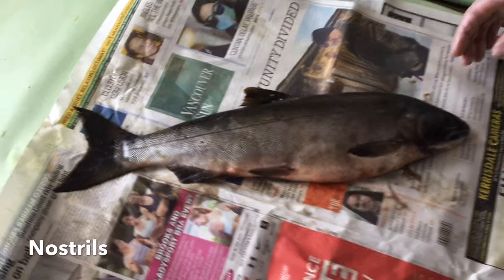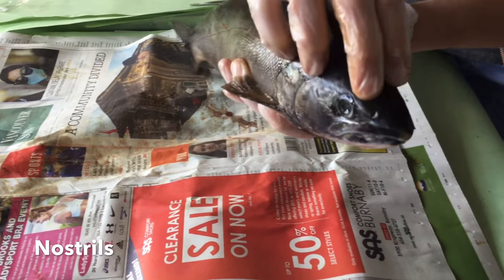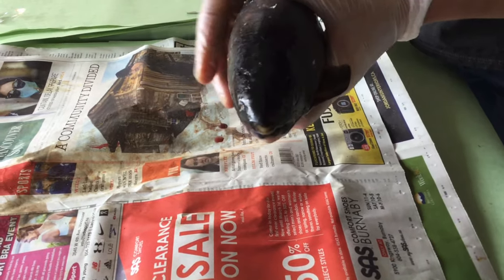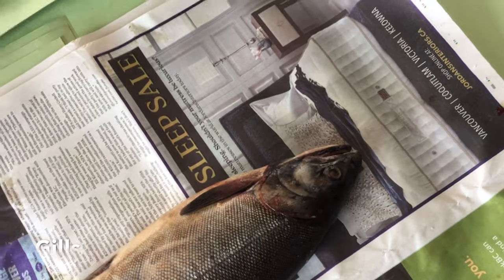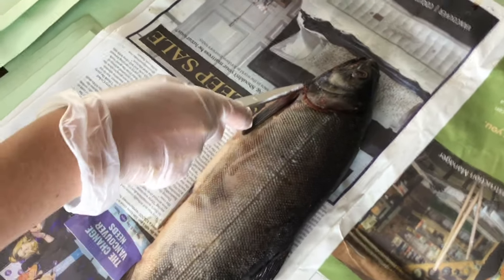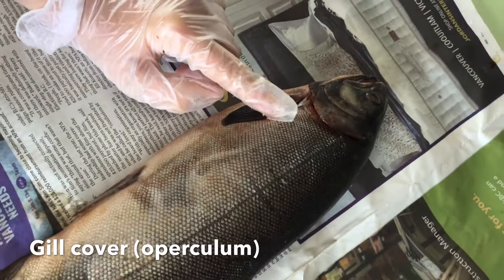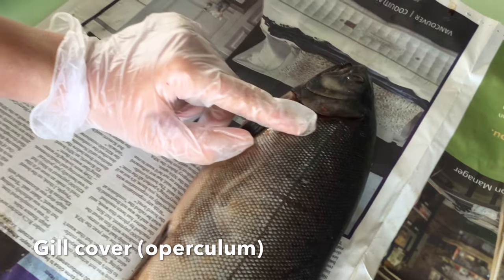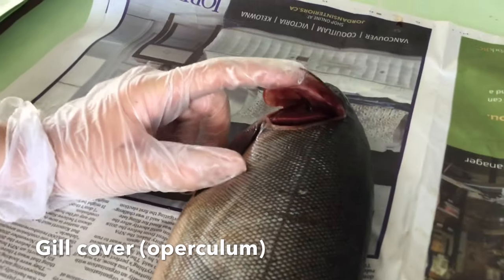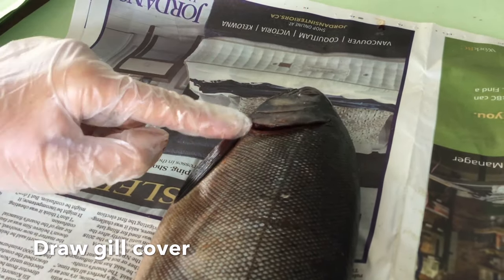We are going to move on to the nostrils now. Miss Anima is going to point out where each nostril is. You can see that they are on either side, close to the eye. Now we're going to move to the gills of our salmon. Alicia, if you could indicate where the gill cover is. Alicia is touching the gill cover right now. This has a special name. The gill cover is called the operculum. And as you can see, there's the gill tucked away inside under that opening. Will you draw the gill cover on your original drawing now?